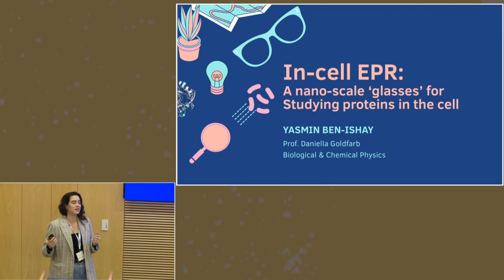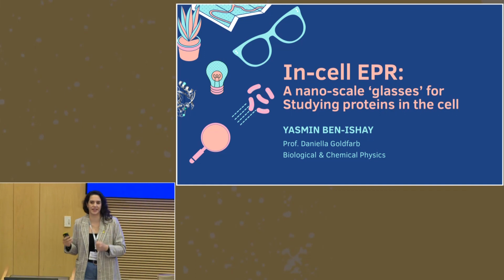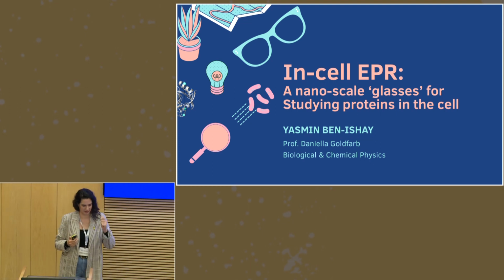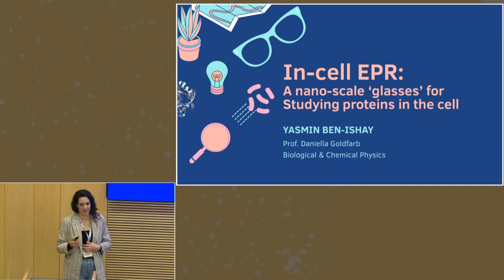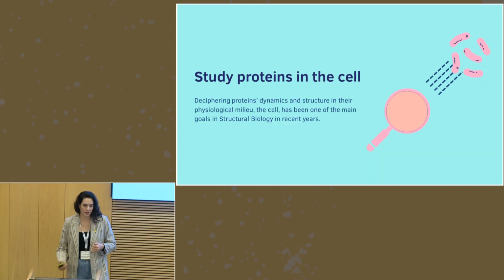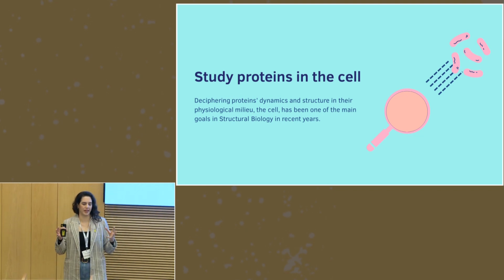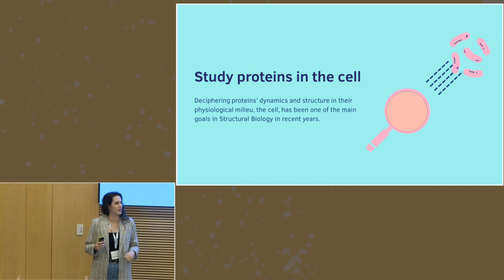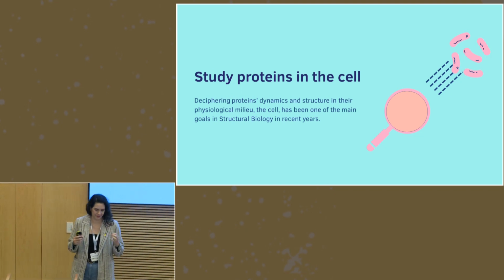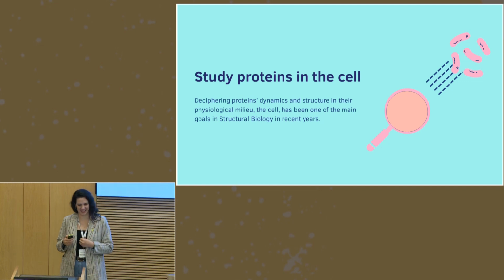We'll do that not only in solution, but also in living cells. And this is the most amazing thing in this method, and it's called in-cell EPR. Deciphering protein dynamics and structure in their physiological milieu, the cell, is one of the main goals in structural biology in recent years.